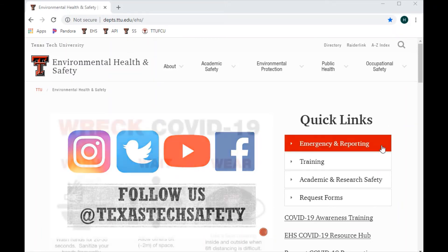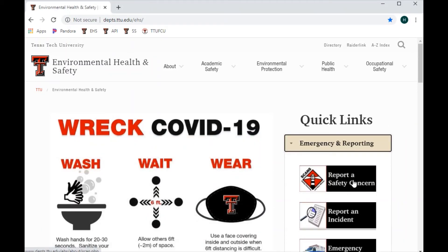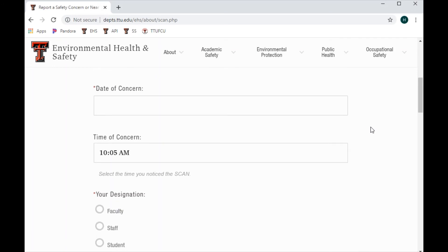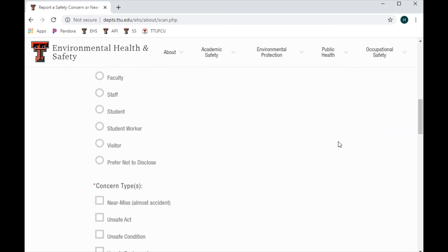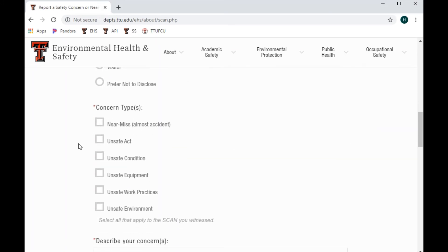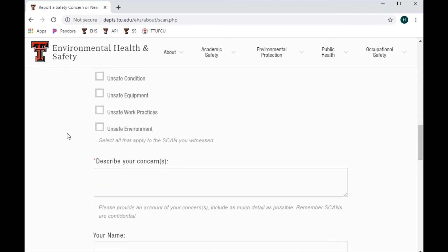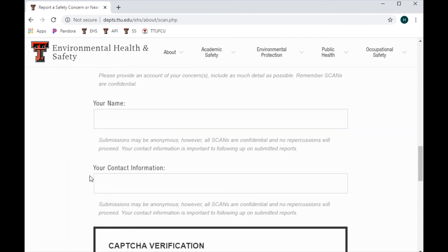Submit a safety concern and near miss report. Go to the EHS website, click on Emergency and Reporting, and select Report a Safety Concern to complete the form. You can fill it out with location, date, time, your designation, and the concern type. Note that for a spill you would not mark near miss. You can always submit anonymously, but your identity will always be protected, so feel free to submit your name.